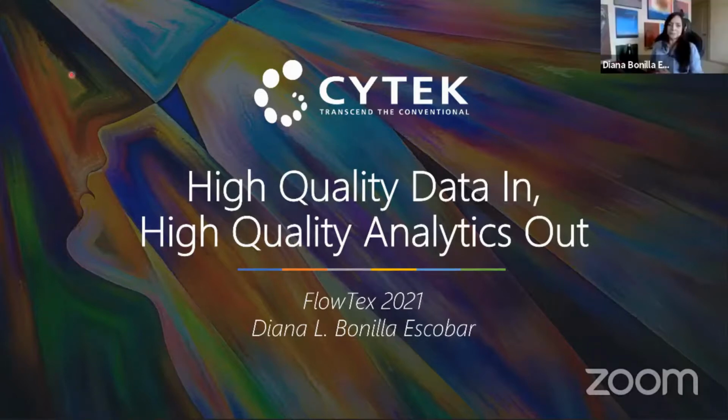Well, thank you. So for data analysis, the old saying also holds true: garbage in, garbage out, or a little bit nicer, high quality data in, high quality analytics out. And especially now that we have seen all the current innovation in reagents, in instrumentation, the measurement of more and more parameters simultaneously in the cells for millions of cells, multiple samples, so very complex data sets. So there is a clear need for robust data analysis tools that allows us to explore the data sets and also understand and capture their complexity.